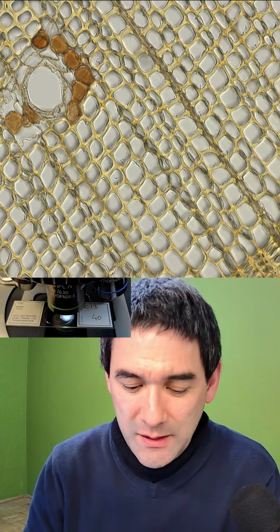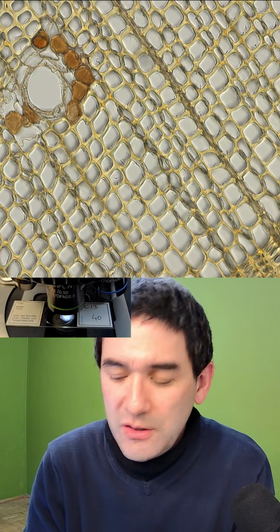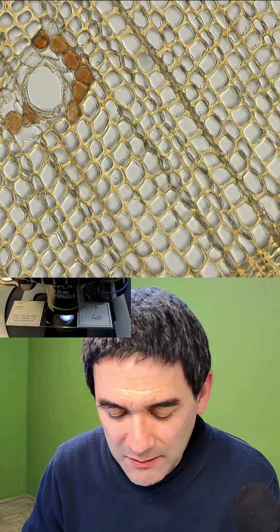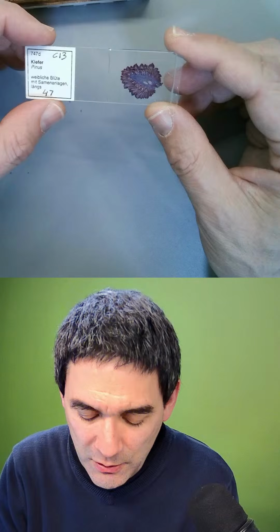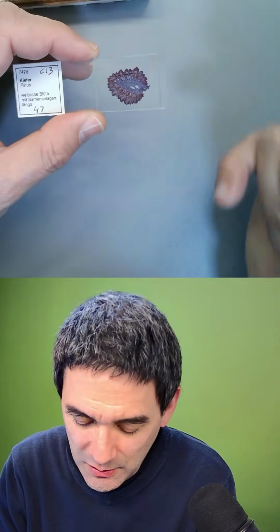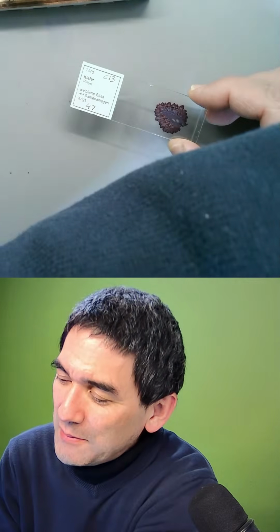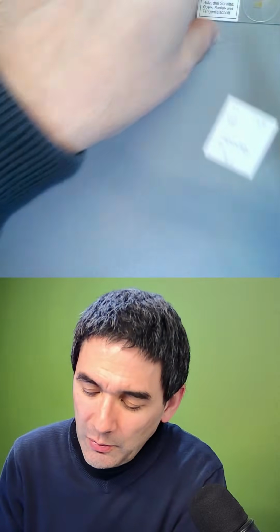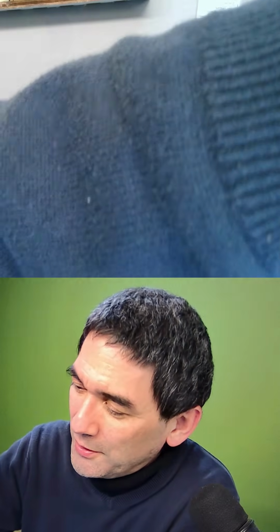Okay, and maybe one of the last slides I want to show you. This is a huge one. And honestly, making this, look at this here. That's the female flower of a pine. It looks very beautiful, and the complexity of nature really can be seen here. And this is also one where I've taken a picture and put it up on my living room wall.